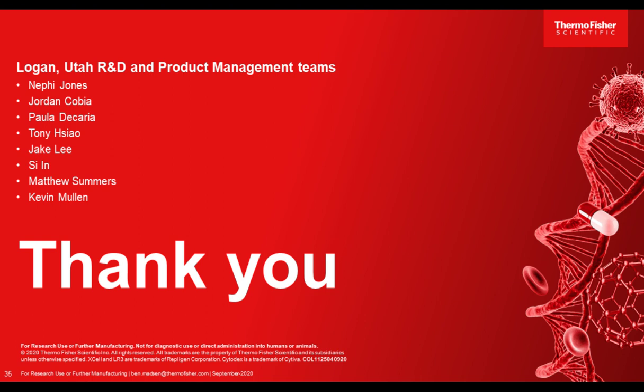But legacy-wise, our impeller power number, we've stated it to have a power number of about 2.1. And we stuck with that number through these tests. But again, we haven't gone through and independently verified that. That's on our docket of things that we'd like to accomplish eventually. So right now we've just stuck with the 2.1 for these, and we just recommend that for scaling moving forward.